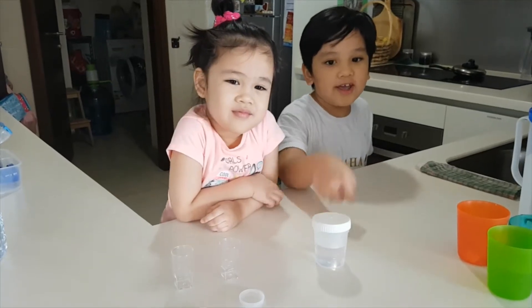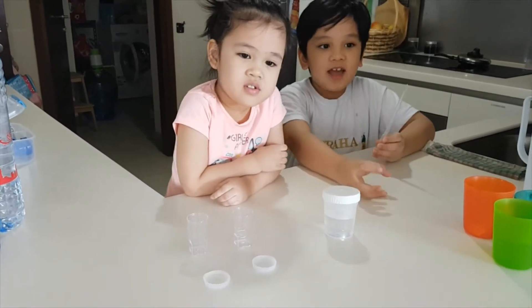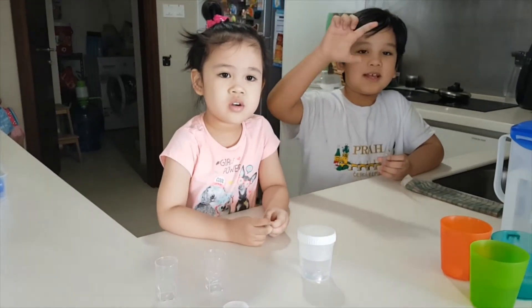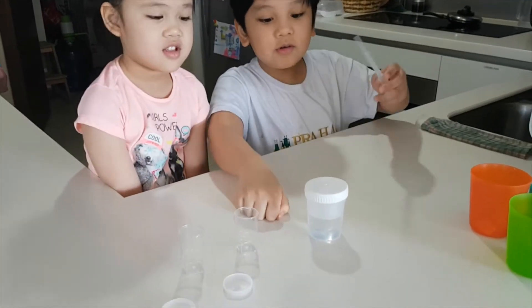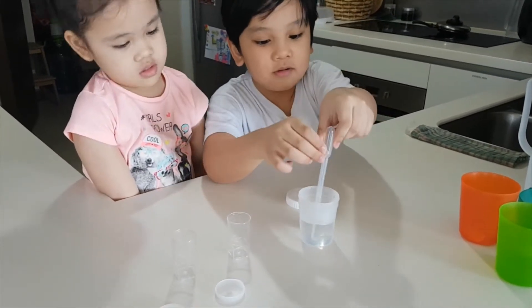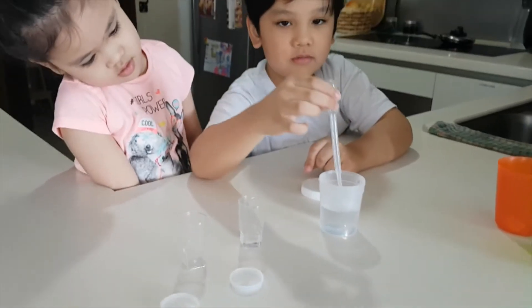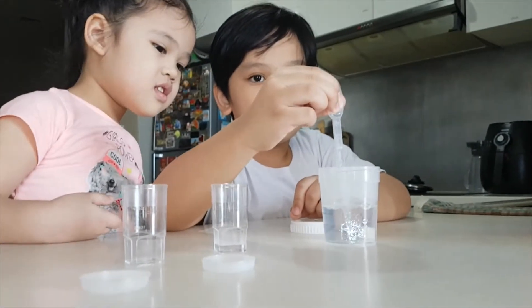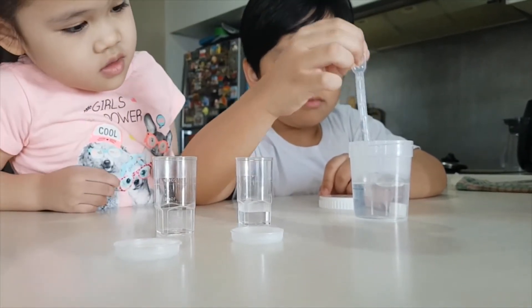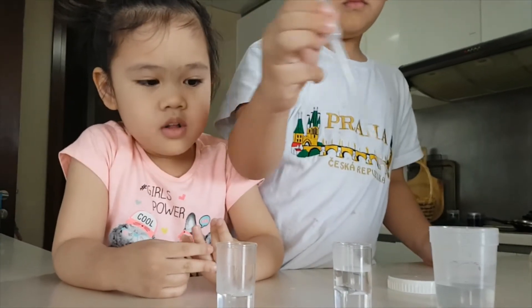This is hot water and I have the transfer pipe to transfer any chemical into any flask, beakers, or test tubes. I am going to transfer this hot water into these two beakers. We have to make sure the volumes are equal.